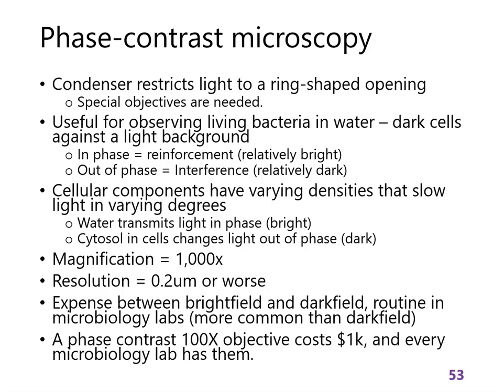A bright field microscope might cost $1,000, and the 100x phase contrast objective would also cost $1,000. And so that phase contrast objective would sometimes be the biggest expense in a microbiology lab. Dark field would be about twice as expensive.